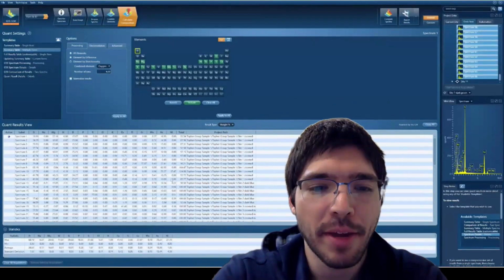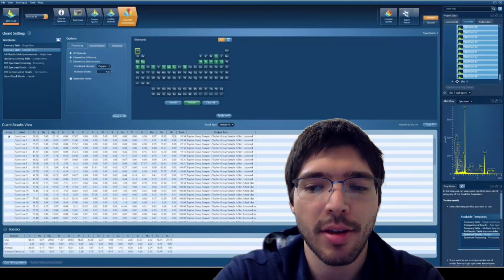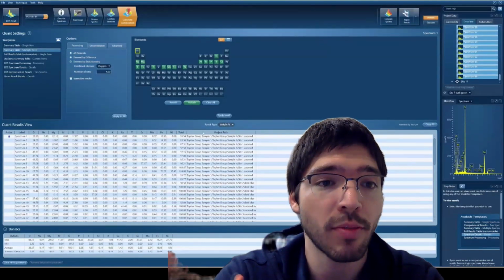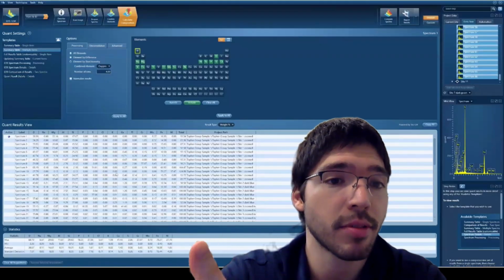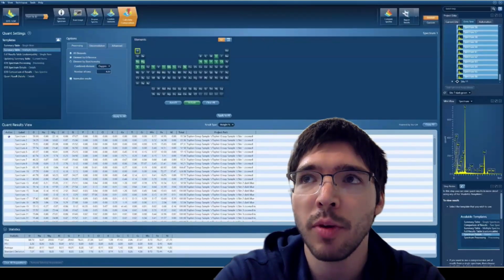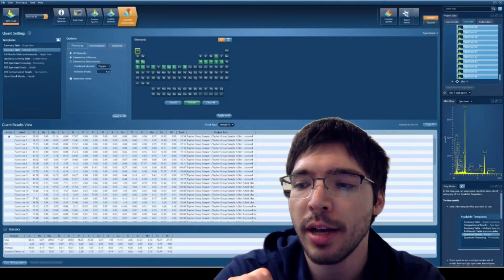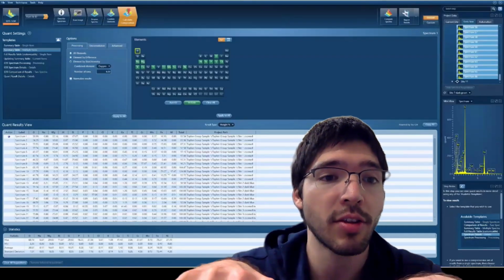Yeah, one of the benefits of the technique that we use when we classify using the EDS and the SEM together is that the electron microprobe, although traditionally used as the default instrument for classification back in the day, and even still nowadays for some people, is very limited. It wasn't exactly designed for having good spatial resolution when you're zooming into your sample.